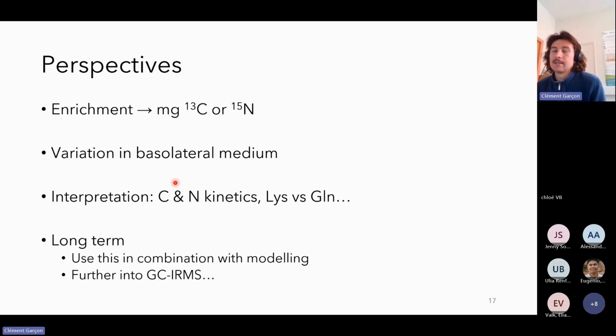But when we do the experiments, there is a bit of rinsing of the layer, and it would be interesting to measure the permeability after that, because we rinse the layer twice and then we use it. The risk is always that the layer is a bit damaged by touching it, or even just with the change of medium to ice and so on, the layer can be a bit damaged and maybe the permeability is a bit increased, and that is something we did not look at. But we did measure that with Lucifer yellow, and the results were good.